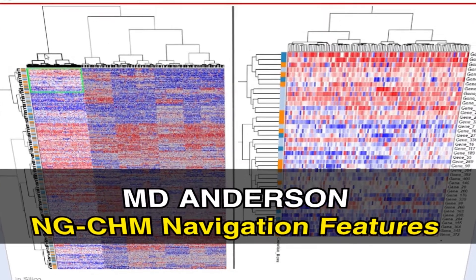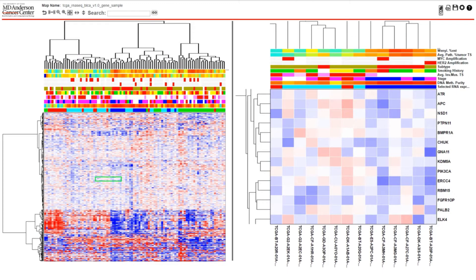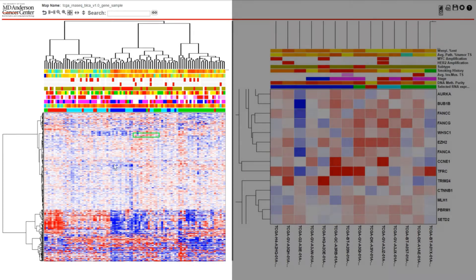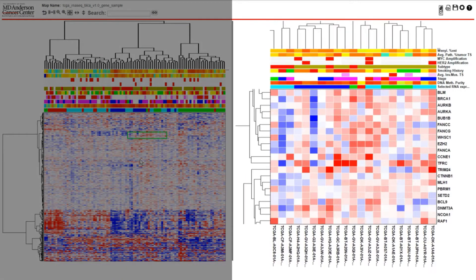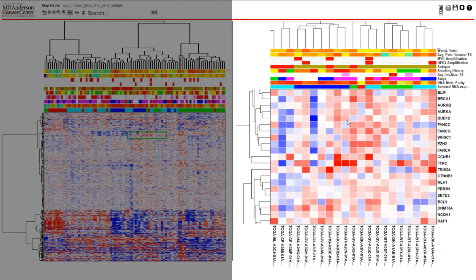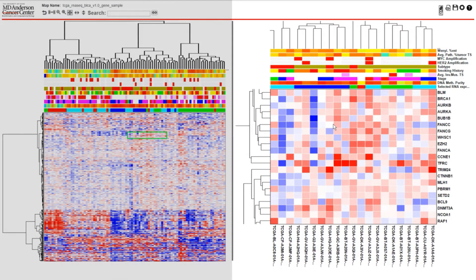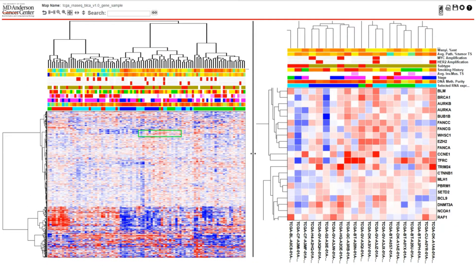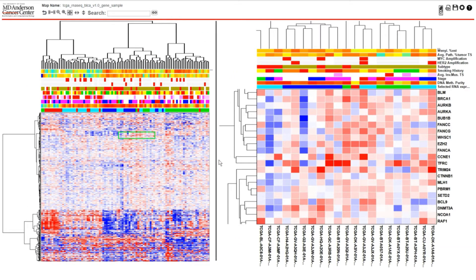The Viewer offers dynamic capabilities for exploring heat maps. There are two panels: a summary view on the left that shows the full map including dendrograms and covariate bars, and a detail panel on the right that shows a zoomed-in view of a portion of the heat map, including row and column labels. The center divider bar can be dragged left or right to change the relative size of each portion of the screen dedicated to each panel.